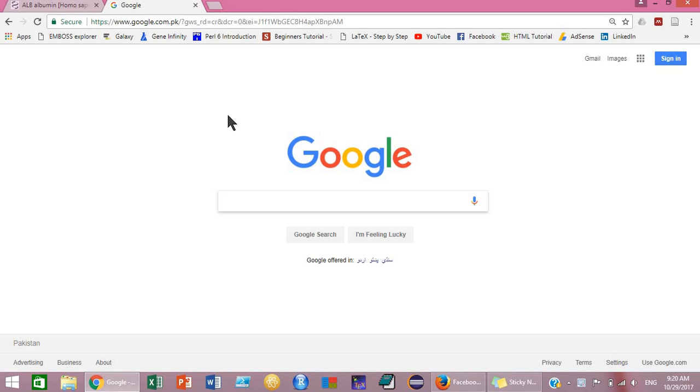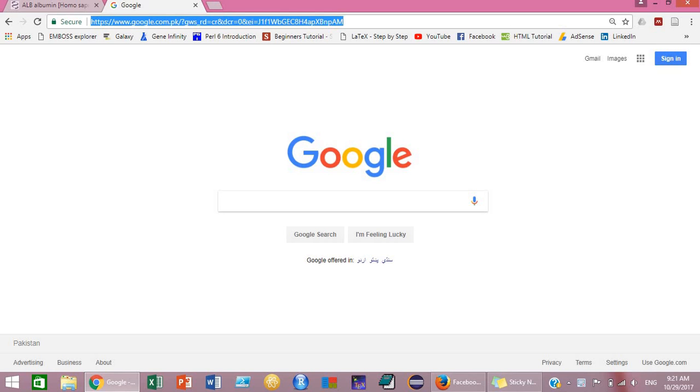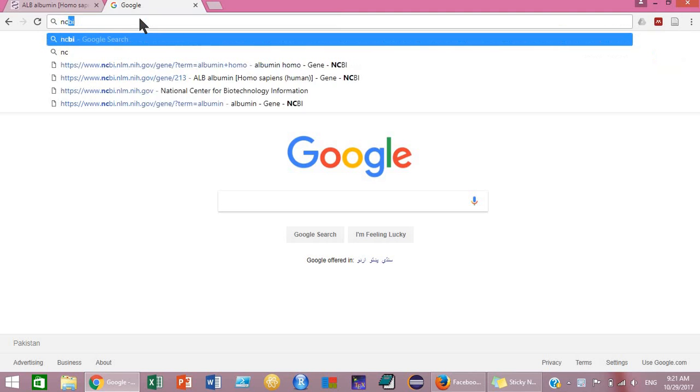Bismillahirrahmanirrahim, assalamu alaikum everyone. Today I'm going to teach you how to design your primers using NCBI Primer BLAST. First of all, you will have to go to the NCBI website.